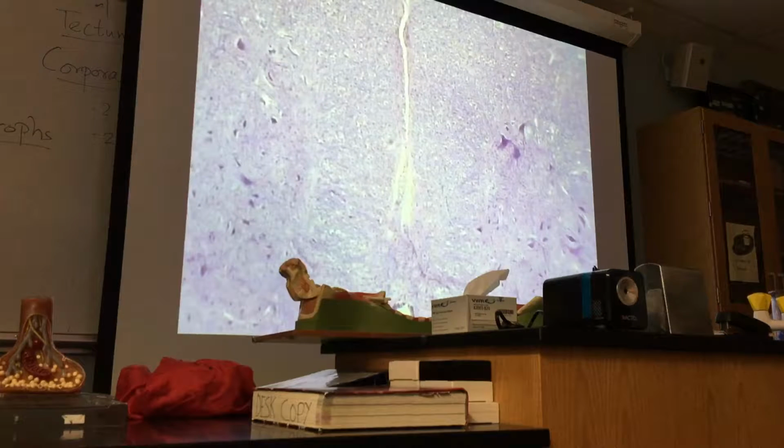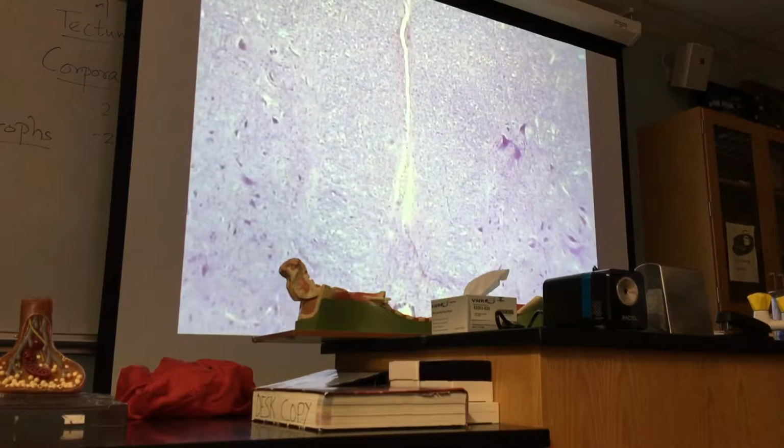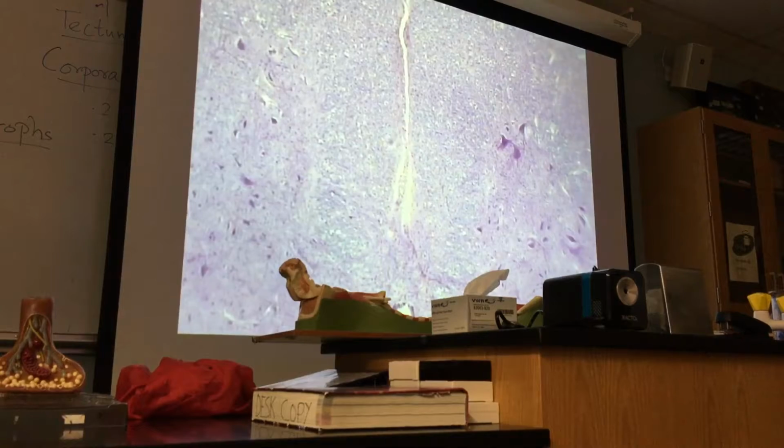Do you see some staining difference between, what is that? Do you see that this region, or this region is different from this region? Yeah, it is very apparent. Mm-hmm. So this is gray matter, white matter? This is white matter. Okay?